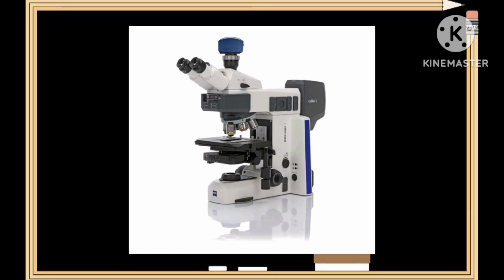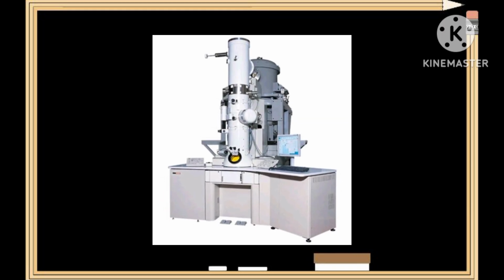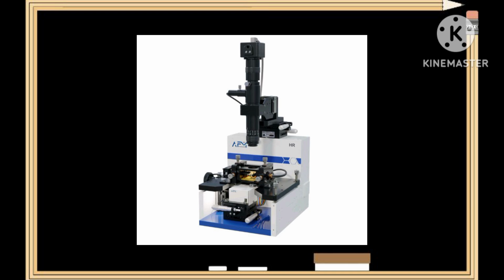Optical microscope is the most familiar type of microscope. It uses visible light and glass lenses to magnify specimens up to 1000 times. Electron microscope uses beams of electrons instead of light to magnify objects up to millions of times, revealing details as small as individual atoms. Scanning probe microscope uses a physical probe to scan the surface of an object, generating highly detailed 3D images at the nanoscale.